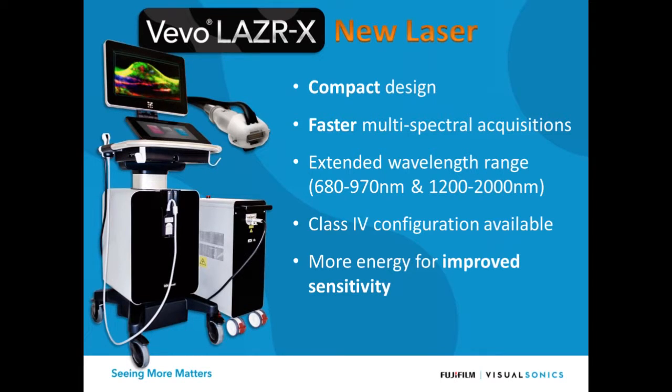You'll also notice that I didn't include a picture of the enclosure in this image here. When you're doing photoacoustic imaging, you're using a laser, and that laser light can potentially be harmful to the eyes, so we've designed an enclosure. And again, those of you familiar with the Vevo Laser will know this enclosure. It's a big box in which all of the imaging happens. We have our rail system, the animal platform, everything's in there. You close it up, and the laser won't fire if the doors are open. If you open the doors, it triggers the interlock and stops the laser from firing, so it keeps everybody safe who's using it in a shared environment, for example.